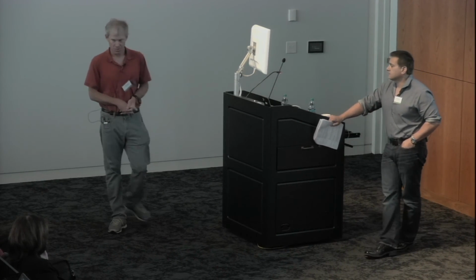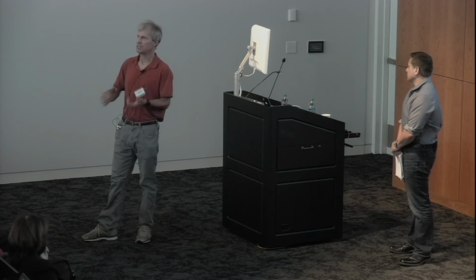or during? So one of the problems with using GCaMP6 in stroke is because it's so sensitive, there's a period just after the stroke where there's very high calcium levels. And there also are spreading ischemic depolarizations. So it's been tricky using a chronic method like GCaMP. So we do have some data with voltage-sensitive dyes early on. And you can even see redistributions of function in the other hemisphere over short time scales.